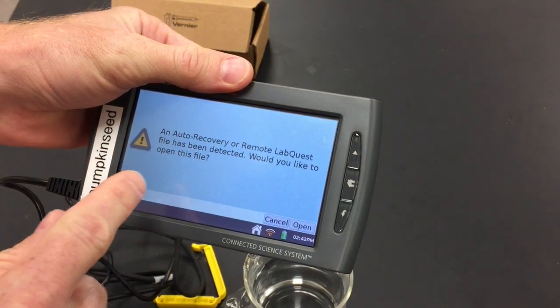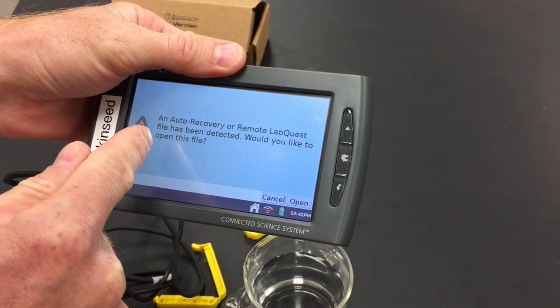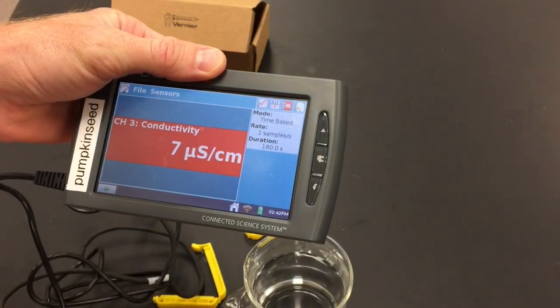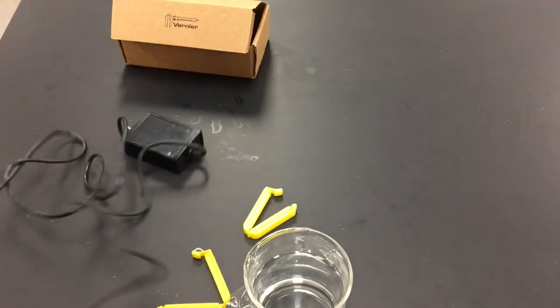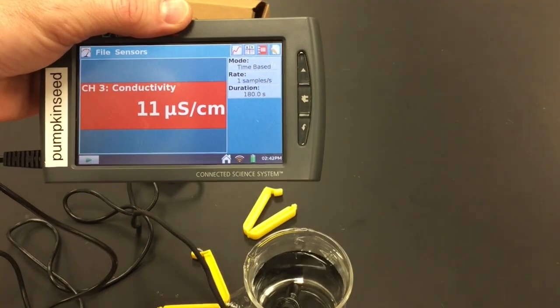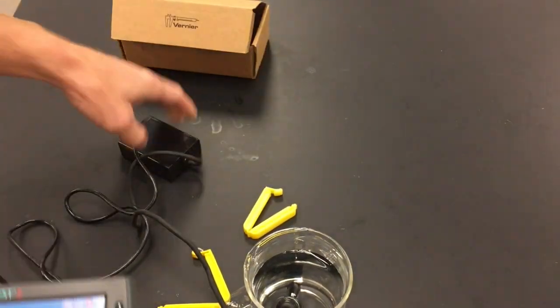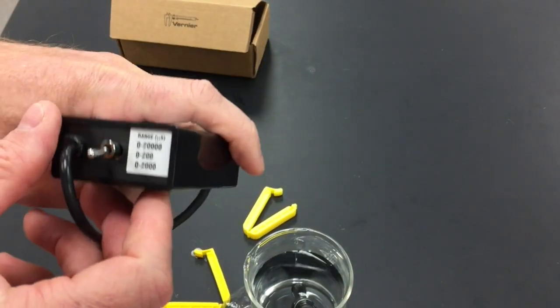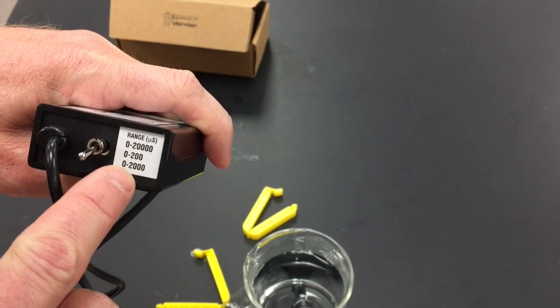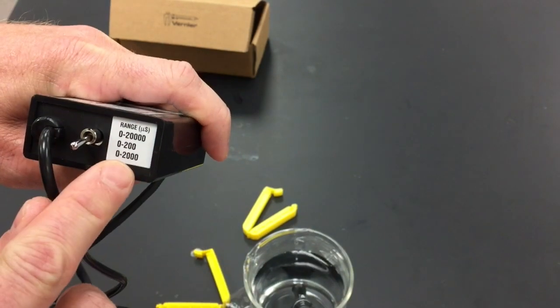Sometimes when you turn on your Lab Quest device, it will ask if you want to open up any data from the last person who used it. I don't, so I'm going to cancel. I can put my conductivity meter in the distilled or purified water and it should come up with a pretty low number. The setting on your conductivity probe should probably be on the zero to mid-range, the zero to 2000 setting.